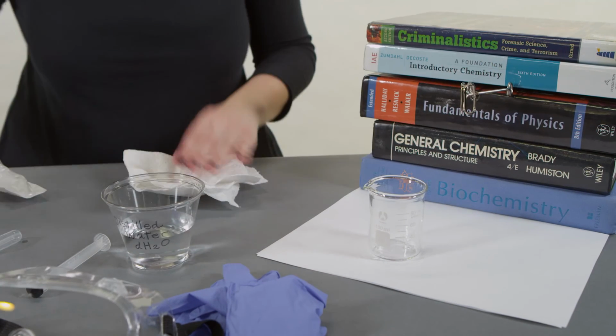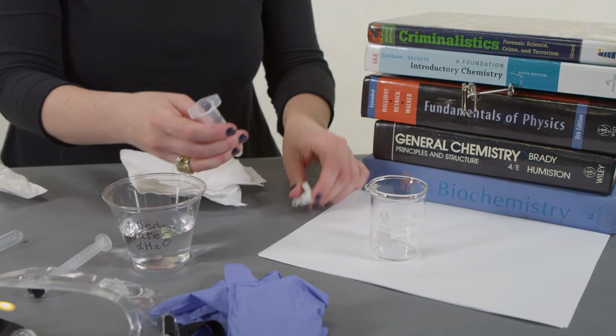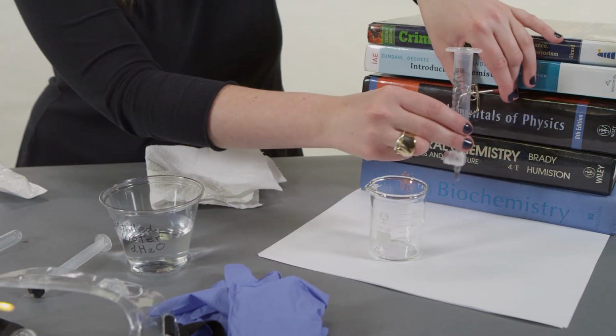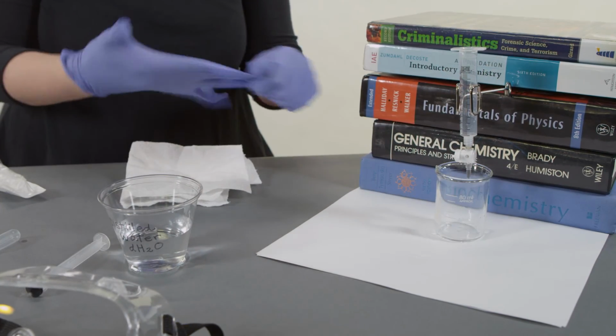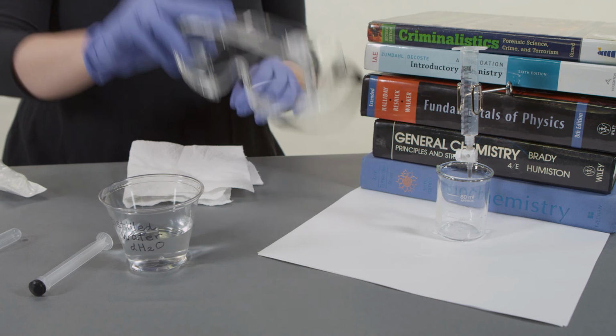Remove the burette from the test tube clamp and remove the stopcock from the burette. Thoroughly dry each of these items with paper towels and then reassemble the titration setup. Put on your safety gloves and goggles, and you are now ready to proceed with your experiment.